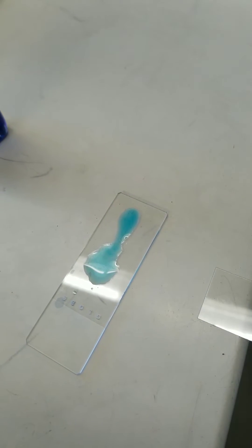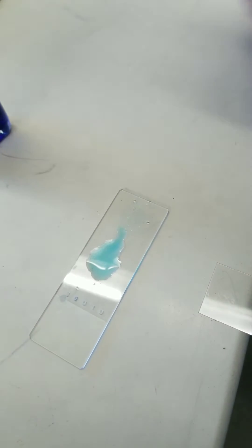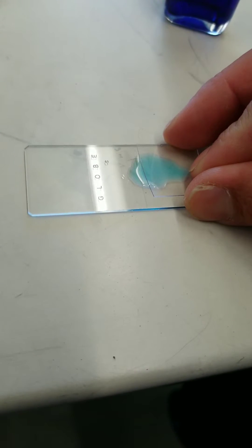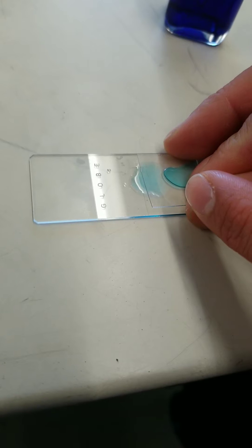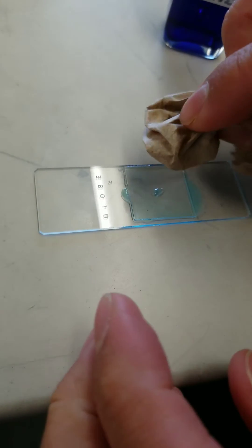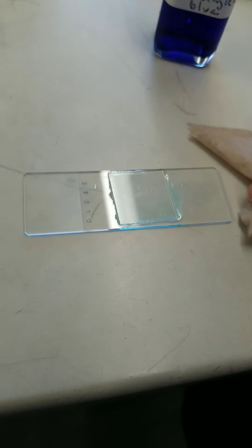We have a bit of excess, so I'm going to grab that up — don't need that much. Now comes the fun part. When we put the cover slip on, we want to put it on at an angle because we want to minimize bubbles. We put it at a 45 degree angle, and we want to let the cohesiveness of the water stick to the cover slip. It's made contact, and then we gently, gently, gently let it down. Center it a little bit, wipe up any excess. And there's our wet mount.